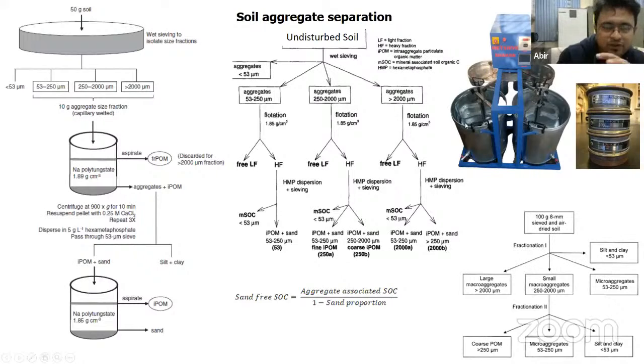and have your water here, because here we are doing the wet sieving technique. Means we are measuring the stability of aggregates against the eroding forces of water. So first you maintain the water level to the base of this sieve. That means we are promoting some capillary rise of water. Whatever micropores are there in that undisturbed soil will already be filled with water.